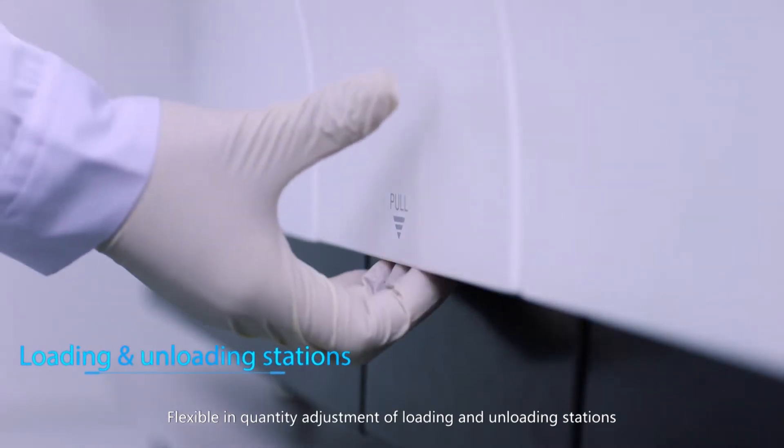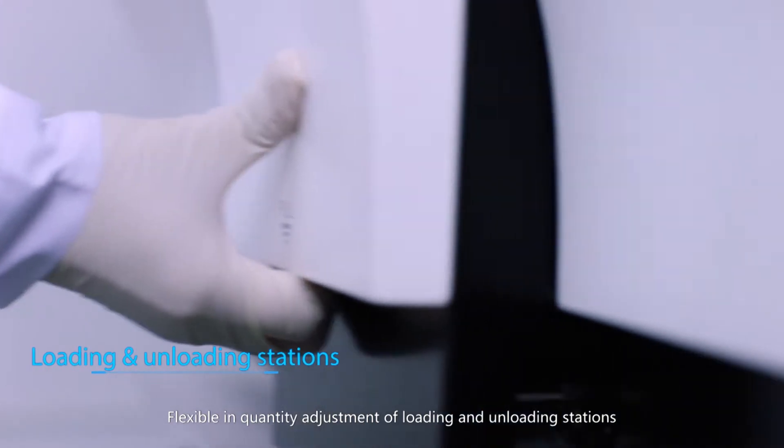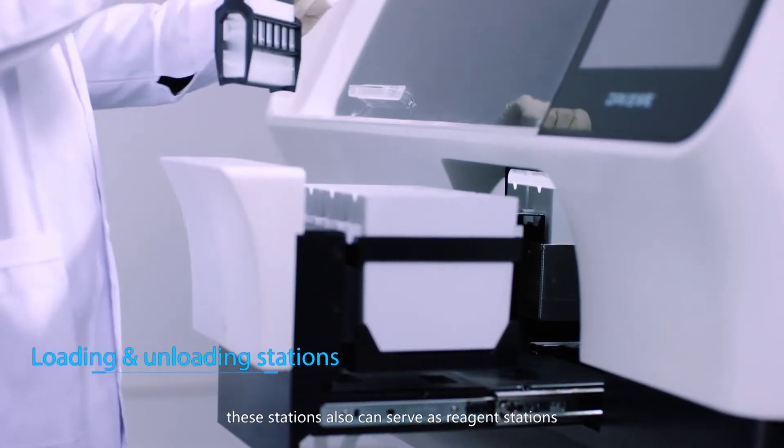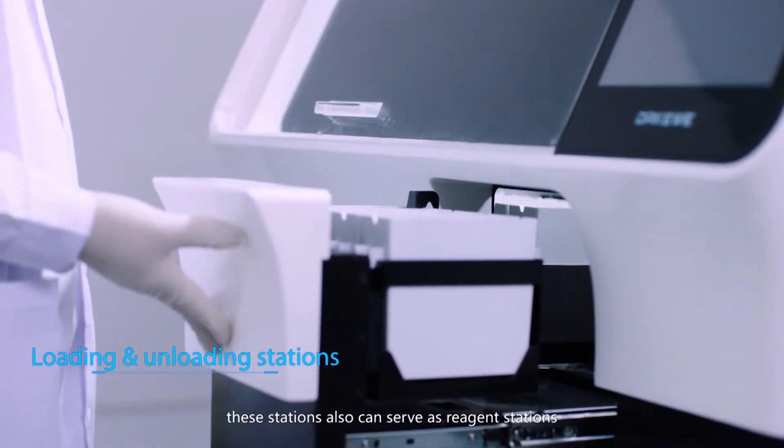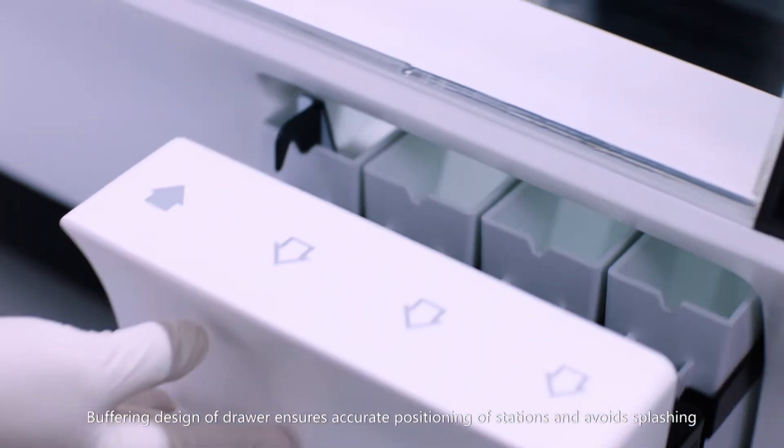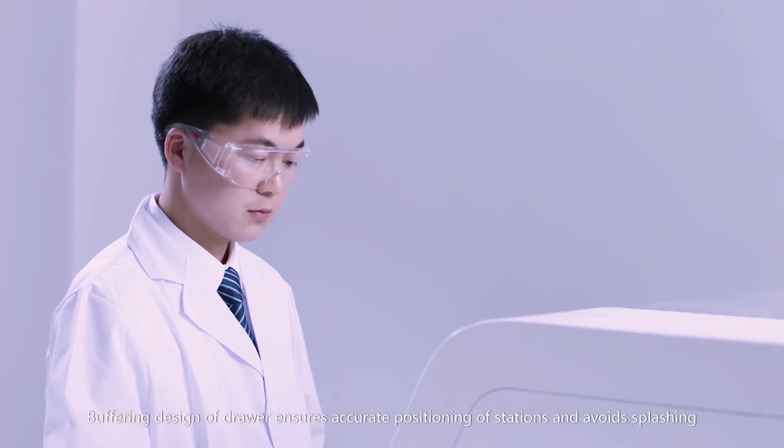Flexible in quantity adjustment of loading and unloading stations. These stations also can serve as reagent stations. Buffering design of drawer ensures accurate positioning of stations and avoids splashing.